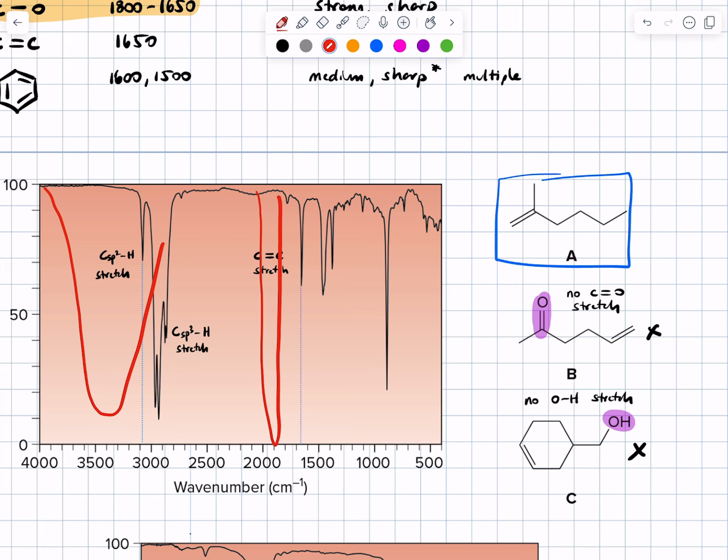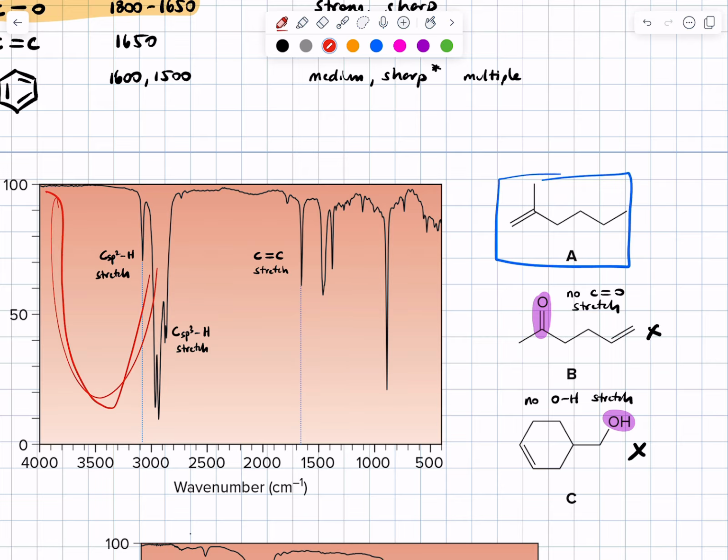If there were two OH groups, can you tell the difference between two and one? Probably not, because they probably occupy the same space and just sort of add together. There are cases where you might see multiple carbonyl peaks. I can't think of any that you'll encounter. So if you see a peak that's consistent with a carbonyl group, you may not know whether it's one or two.